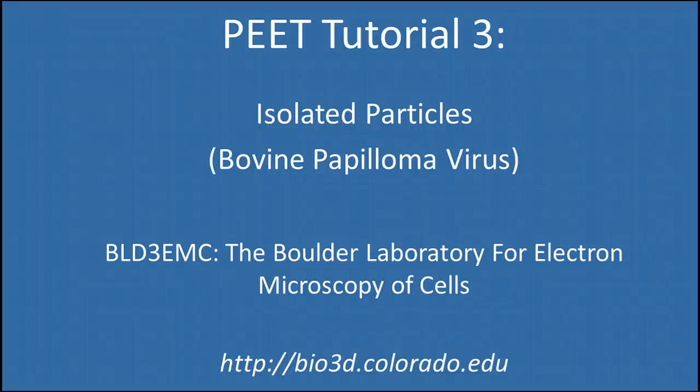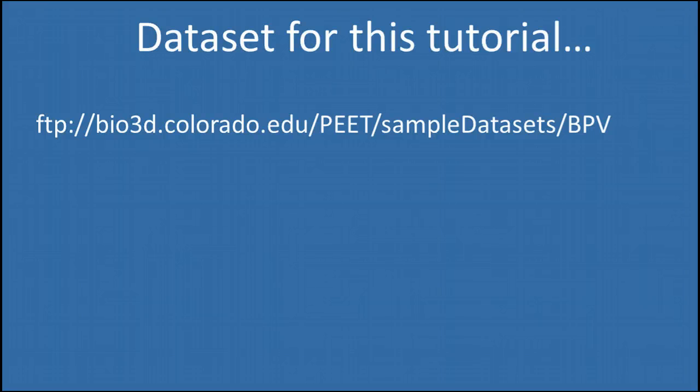In this tutorial, we'll again look at aligning and averaging isolated particles, in this case using real tomographic data. Specifically, we'll use a cryo-electron tomogram of bovine papilloma virus. The sample dataset can be downloaded from the URL shown on your screen.